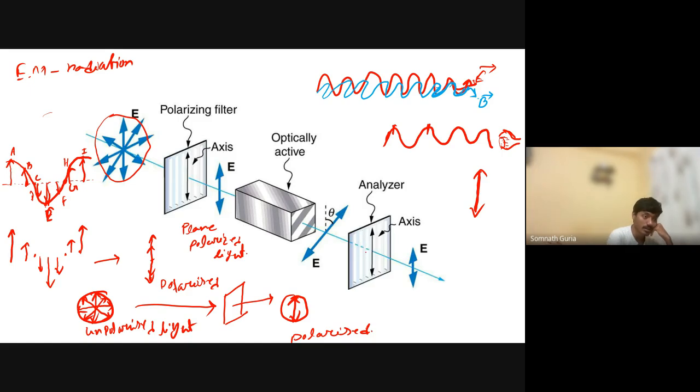From that we can calculate the degree of rotation done by these optically active molecules. Okay, so that's how we find the optical rotation, the amount of optical rotation.